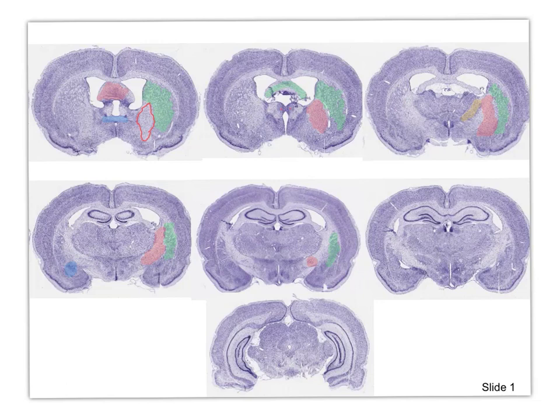All right, so moving more posteriorly, we've already lost it, so it's very, very small. And I should mention a couple other things. The striatal nigral pathway happens to be right here at the tip of the posterior limb of the internal capsule. Here we have, in the next section, a nice view of the subthalamic nucleus. So it's here and there.